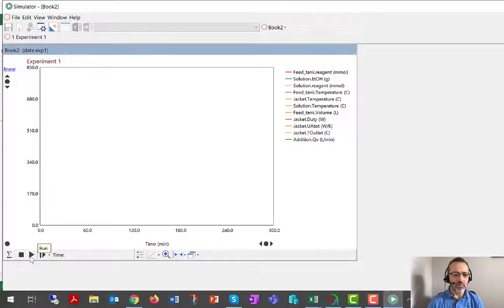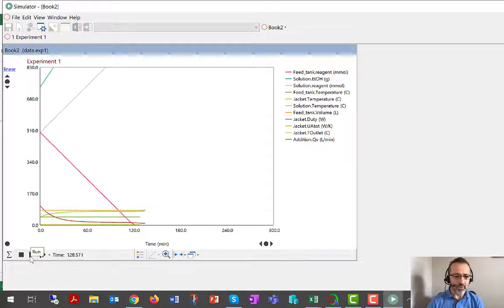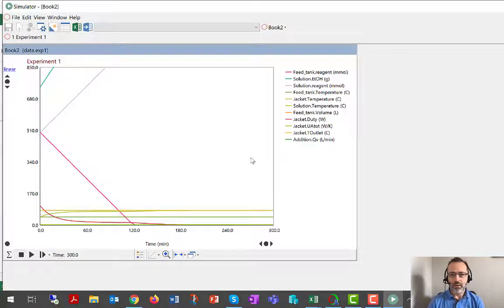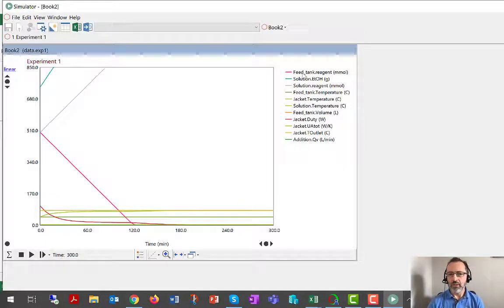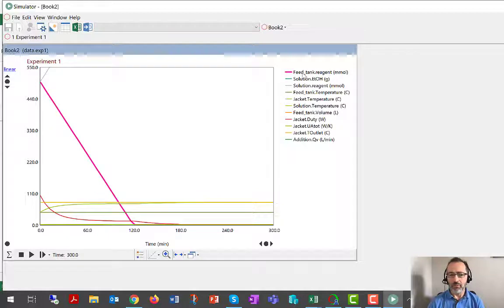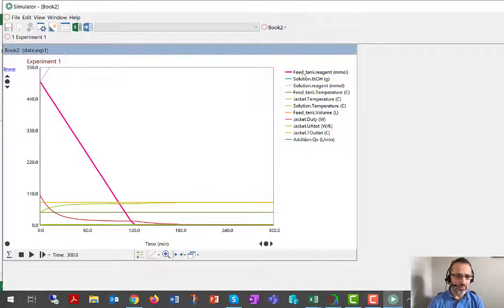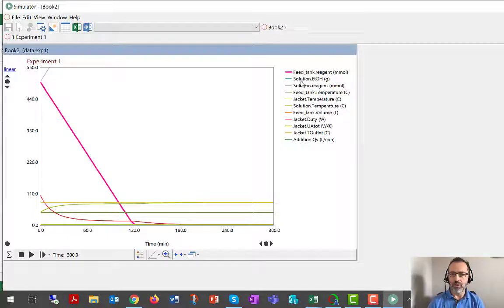This time, I'm going to press the play button and have the model run. What we're going to see is, for example, feed tank reagent starts high and then disappears.